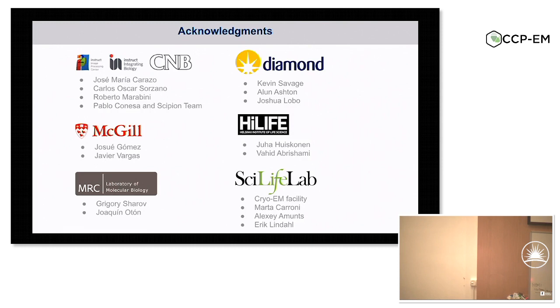Any questions? Jose Miguel, how much work will it be to rip out the Xmipp data model, which is now inside Scipion, and replace it with your EM core library?